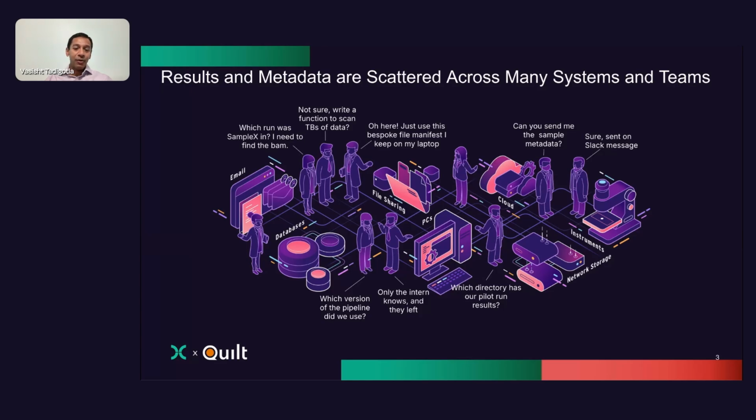But on the same samples, we also have other assays that are run that are low throughput, let's say ELISAs, PCRs, things of that nature. Flow is another example. So now you have two separate systems with data in two separate databases, if you will. And it makes it a little harder for teams to draw inferences across the data set.